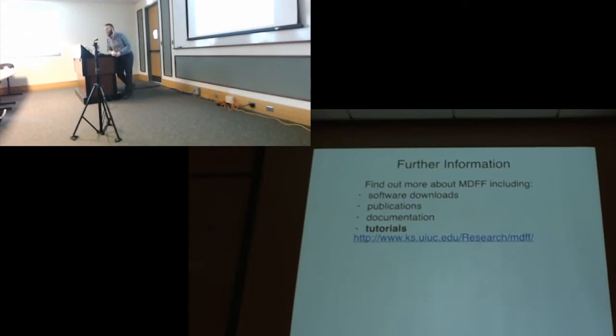So the way of doing minimization is similar to moving from the saddle point to the local minimum? Yes. So it gives more information about the global state. That is the concept. So what if we cannot fit the side chains in the density, and they can be anywhere? Once we pull it, there may be steric clashes, and we want to minimize them.